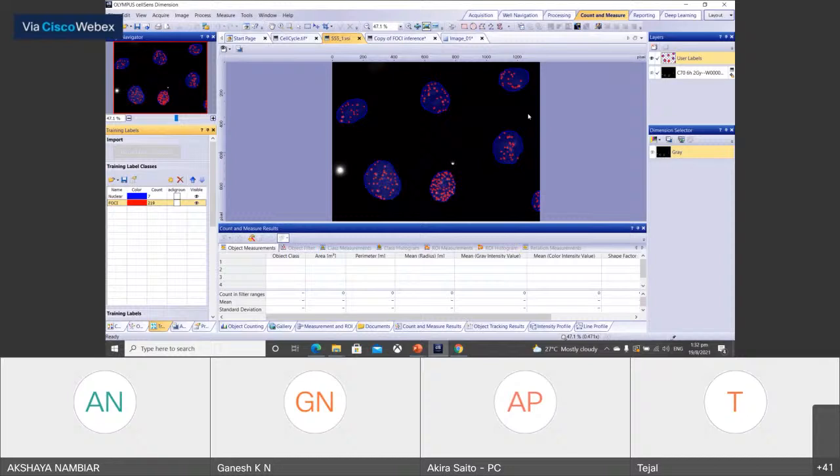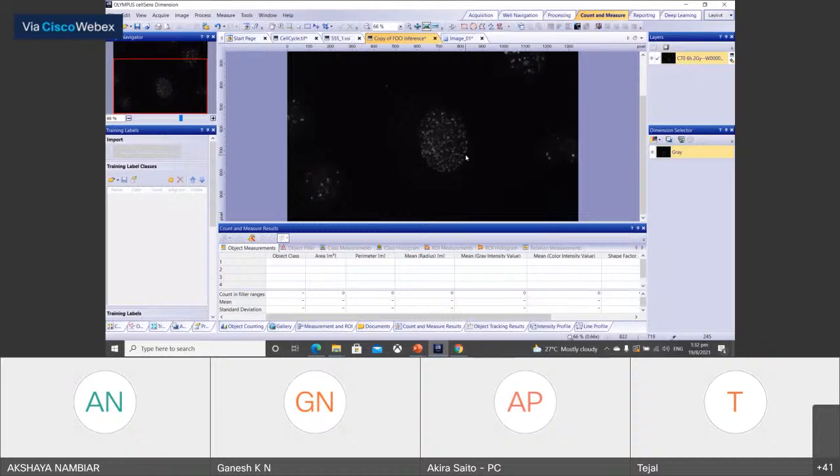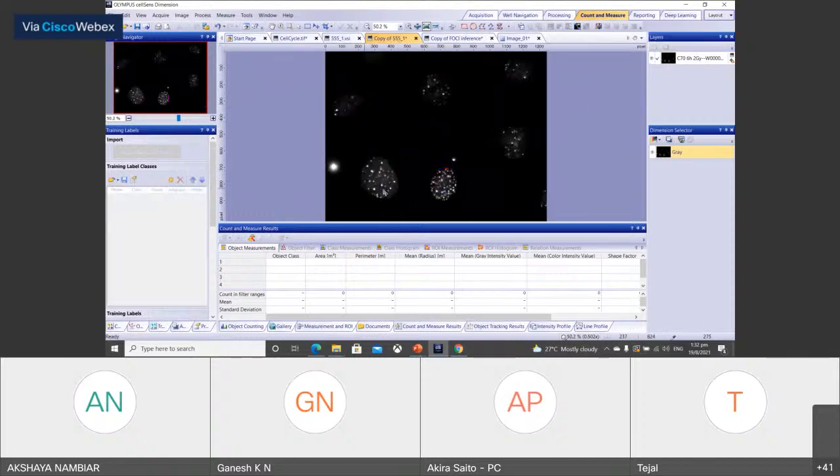So yeah, I already labeled, but I will show you how you can label this one. This is the image with the nuclei and the foci inside the nuclei.